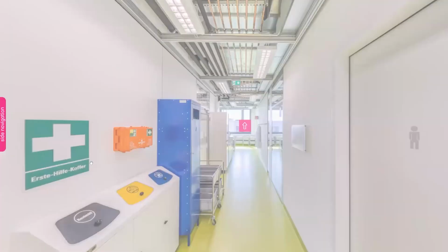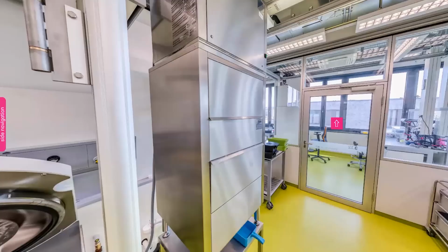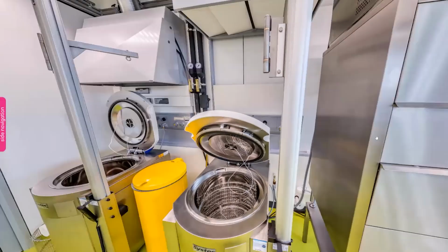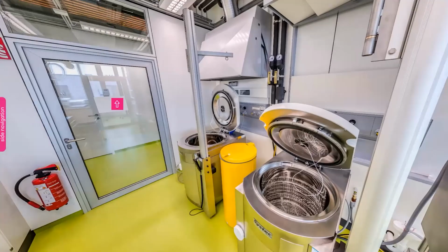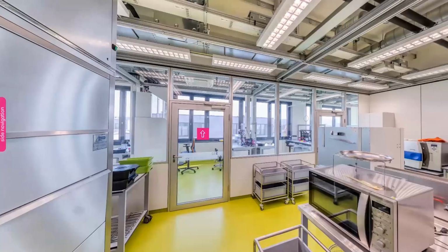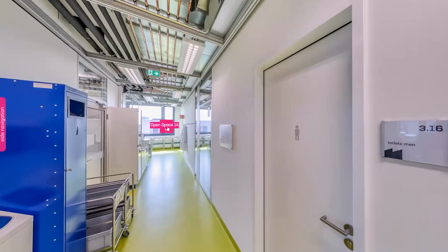We now come to here, which is the cleaning service or cleaning kitchen. And that's actually one of the services that we offer to the startup. So you do all the work yourself, the scientific work, the pipetting, everything. But what is included in our offer is the autoclavation, the trash, the dishes, the dishwashing, providing ice and so on. All of that is what we offer as a service within our cleaning service. So that is what we do with Life Science Factory personnel. All the rest needs to be done by the startups' teams and personnel.